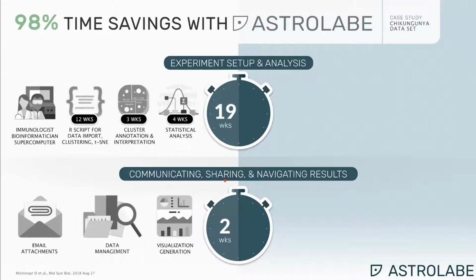And I would say that this is not unusual. Again, going to the curve I've shown in the beginning, the more complex the project, the more complex the demands. And I think that people spending 20, 30, 40 weeks on their CyTOF data set is not unheard of.